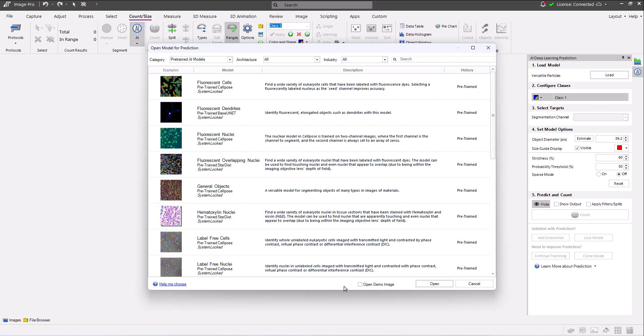I'm selecting the open demo image option. With this option selected, an image opens with which you can test the model. The correct prediction settings also load with this option selected, helping you become familiar with how to use these settings with your own images.